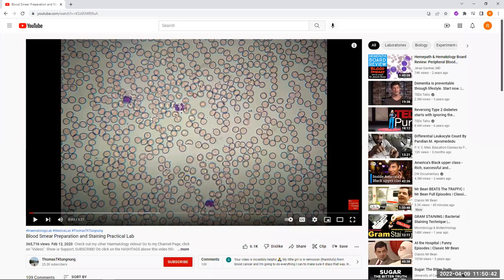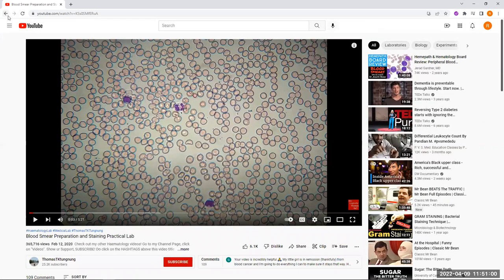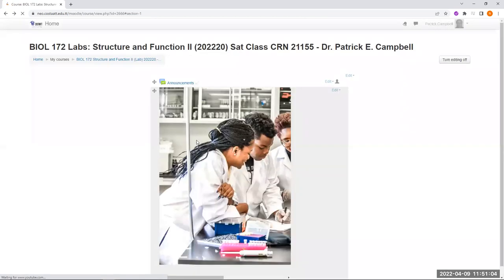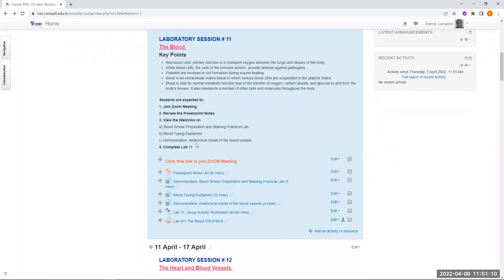Right, so blood smears, you can just have a look at it. What are all of these blood cells we're looking at here? The most numerous of the lot? Red blood cells. Right, so there's a red blood cell. The video speaks to the nomenclature, how they go about naming the particular cells. They have an atlas and do it by comparison, based on knowledge, or you could just do it by sight. It comes off the user atlas and they identify the cells. As you go along, you get more and more adept at it.